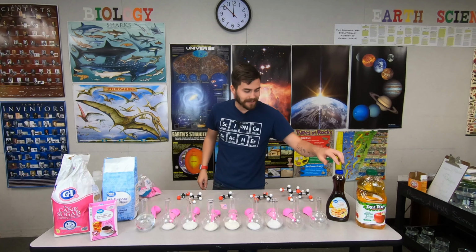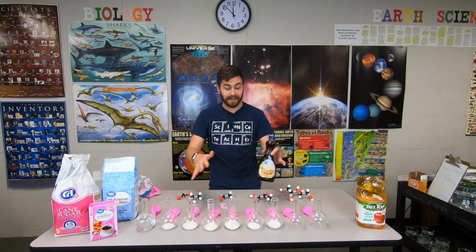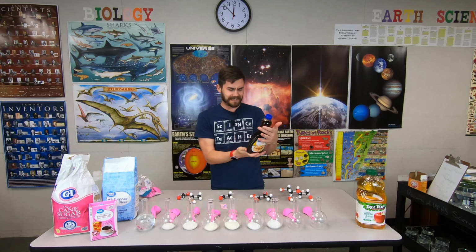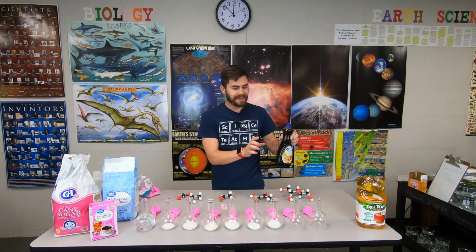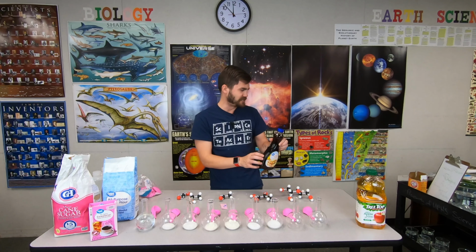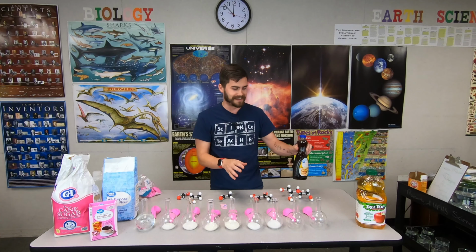This flask is going to have syrup in it. Now, I've never done this before. I've done this lab several times, but I've never used syrup. Syrup is really just liquid sugar, if you think about it. And I looked at the label and I did some very simple math. This beaker will have the equivalent of, let me double check, 173 grams of sugar inside of it.